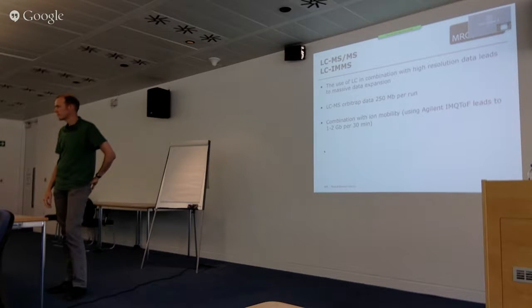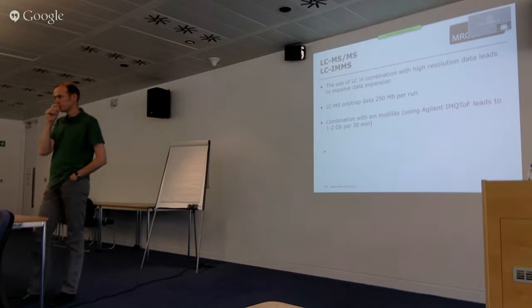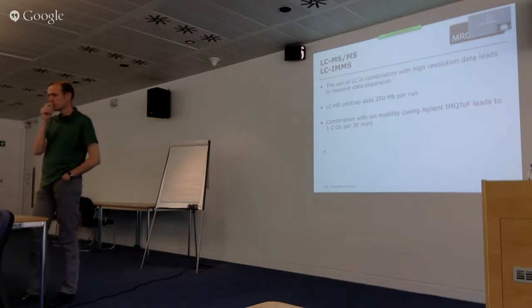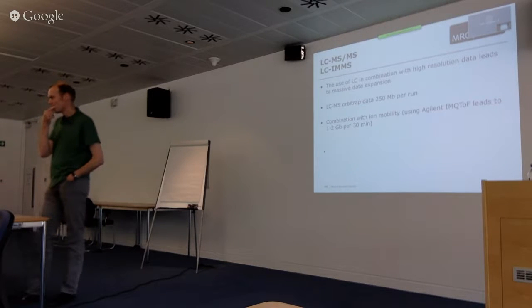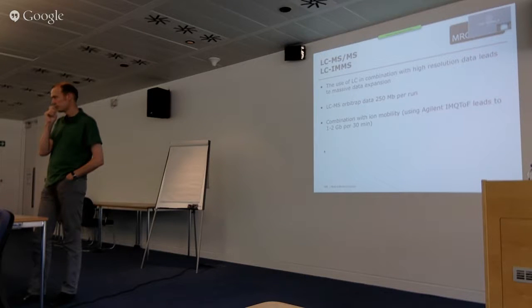Will there be better processing methods in the future? Probably there will, and that's the difficulty of predicting it. Something like QC data could quite easily be utilised by such a method, and then that information could be subtracted. I think the only way you could consider cutting out the QC is when you have that. If somebody invents an assay that is perfectly stable and always gives you the right answer, that's a long way off.